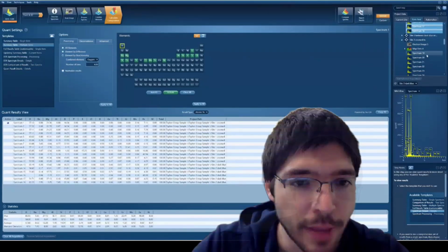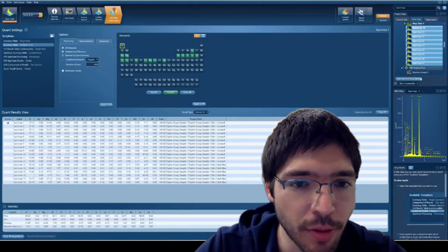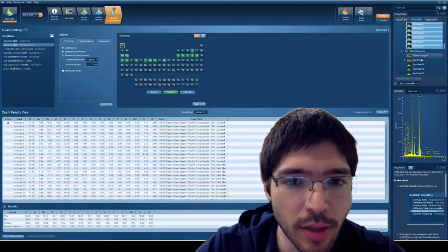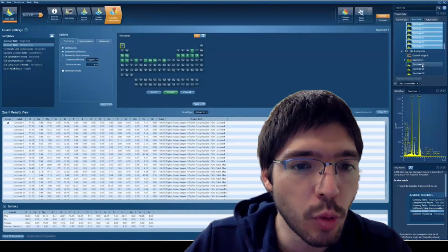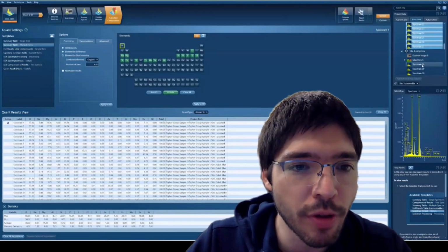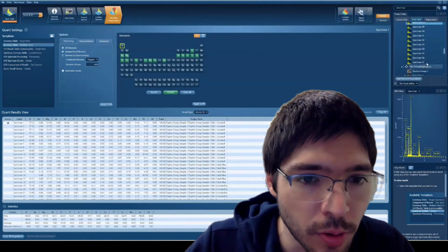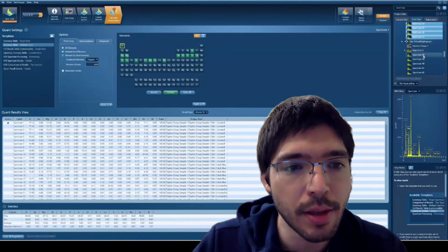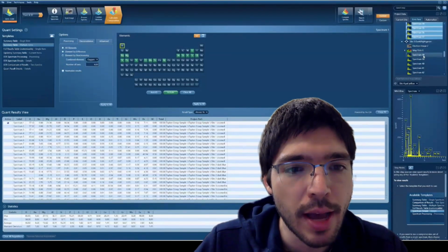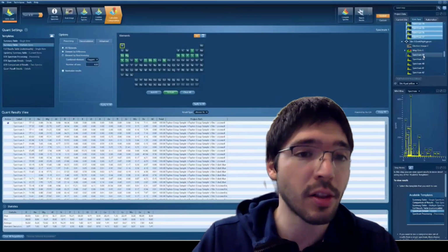Very cool. Yep, and then what I'm doing there is I'm essentially putting all of the different spectra onto this large view window here, and I'm making sure that all the elements that you see listed, going from oxygen all the way to nickel, are correct. We don't have any random elements in there. I'm making sure they're in atomic percent. Another way of saying that is molecular percent.